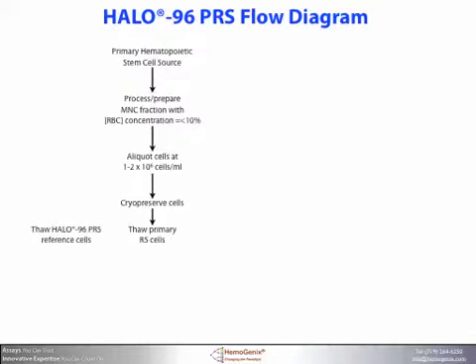The first is a primitive lymphohematopoietic stem cell population designated HPP-SP that can give rise to both lymphopoietic and hematopoietic cells. And the second is a primitive hematopoietic stem cell population, CFC-GEMM, that gives rise to the hematopoietic lineages only. The slope of the linear regression for each stem cell population measured provides the proliferation potential and therefore the potency of the stem cell population. Compare the proliferation potential of the established primary reference standard to that of the PRS reference cells.